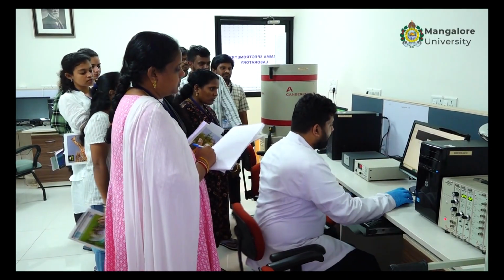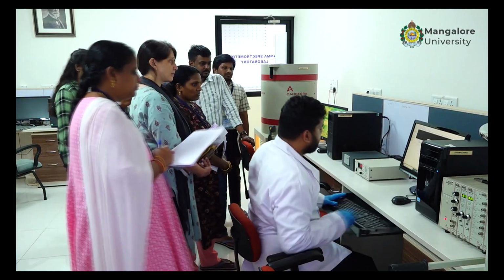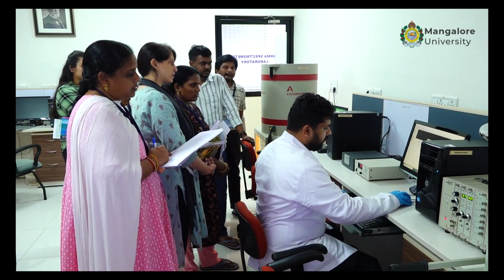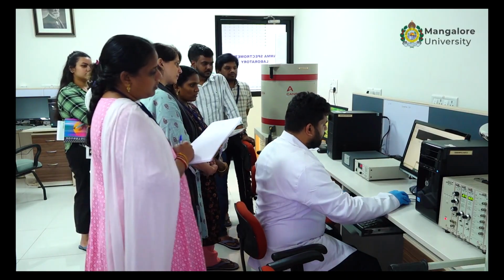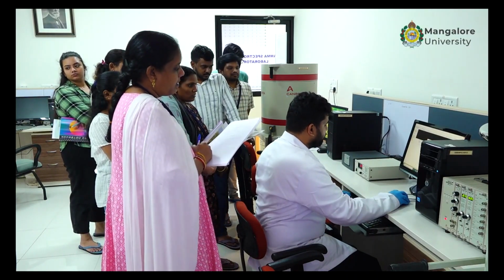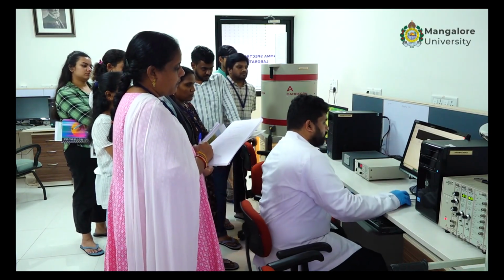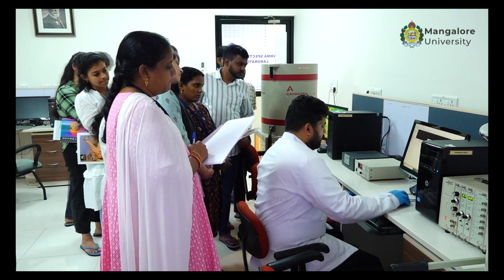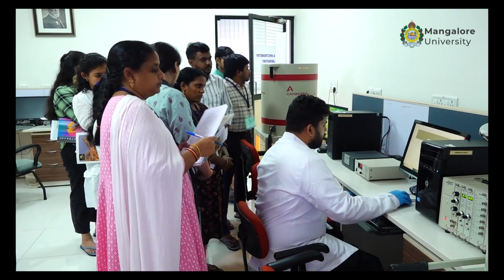Is the MCA communicating or not? You have to check. It's on. The service manager is on. Switch it off. So it's not responding.